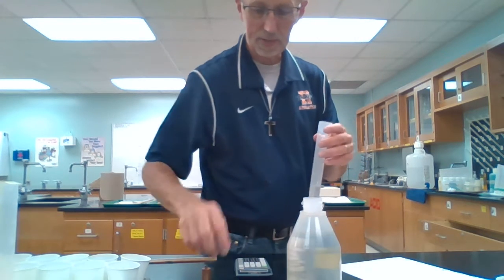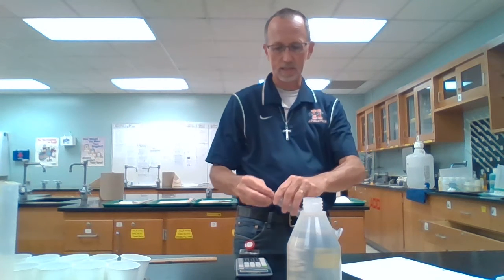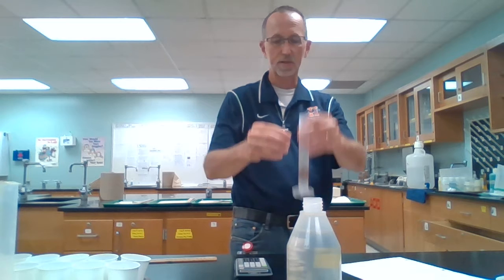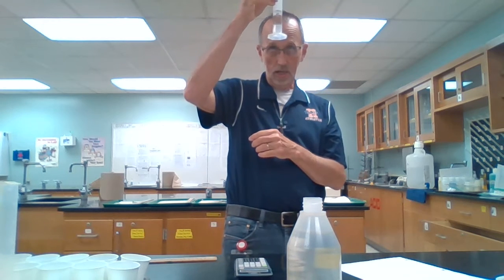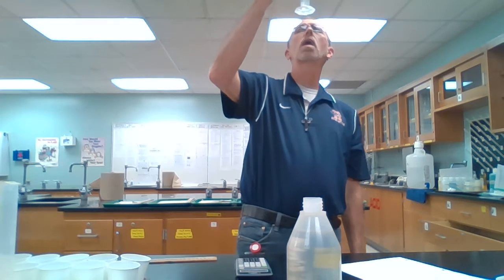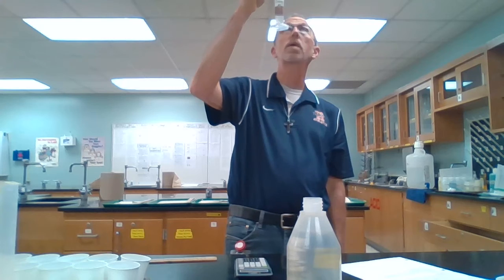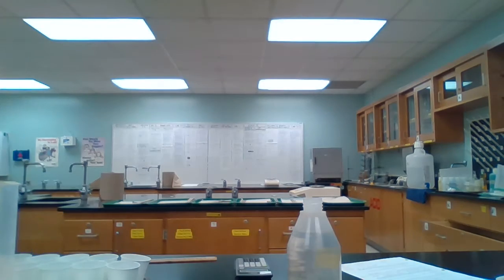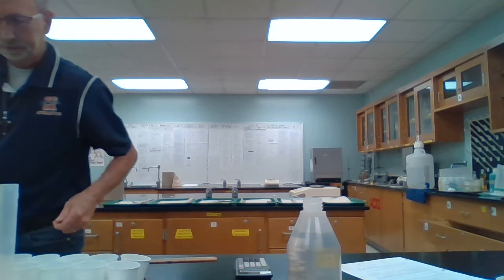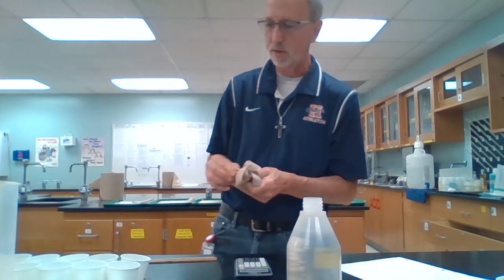Okay, looks like we got right about 10.0 mL, so I'll slide this in nice and easy so it doesn't spill any water out. And it looks like it raised up. We're at a little over 16, so about 16.1 minus 10, 6.1 mL. So that would be our volume for number 3, 6.1 mLs.